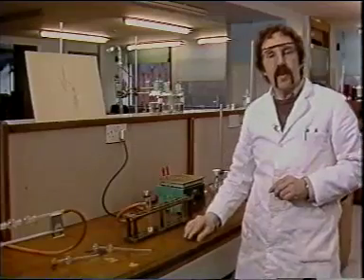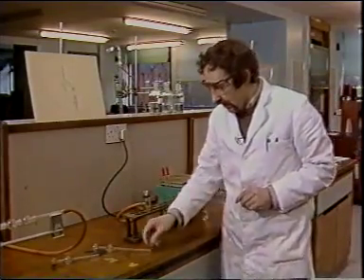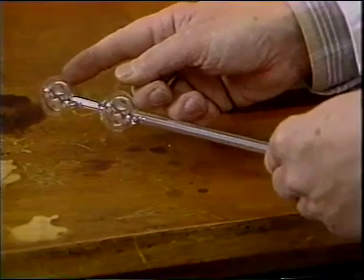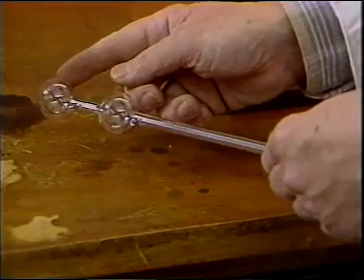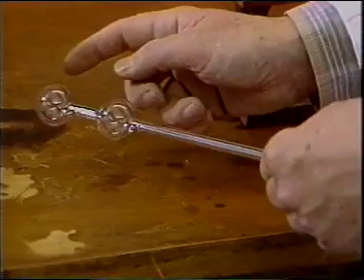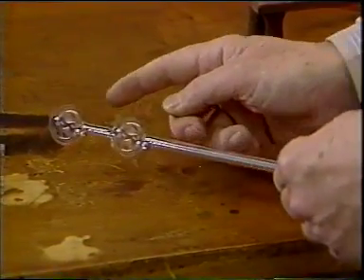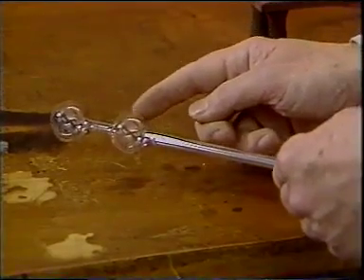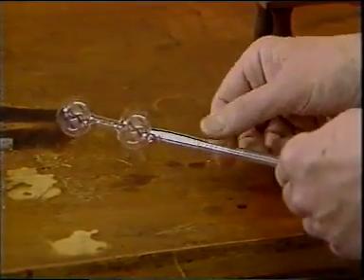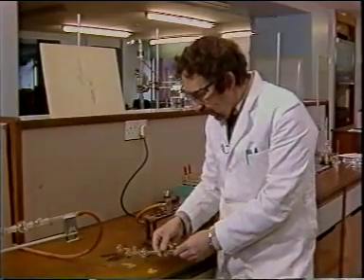If we have even smaller quantities of liquid, we may need to use bulb-to-bulb distillation. Our impure liquid is placed in this bulb. Suction is applied at this end, and then this bulb is heated and this one cooled, with the result that liquid distills over from here and is in a purer form in this second bulb. Here is one in which that process has been carried out.